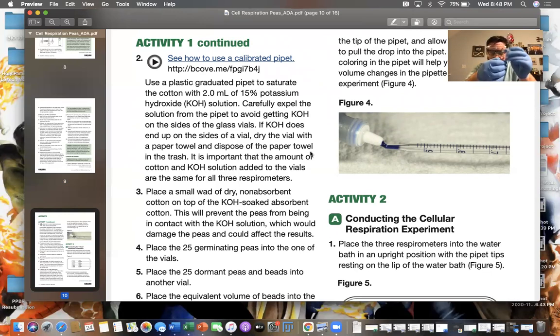If you go up to the top here, so without the water going into the bulb. So you need to do 2 of these onto each one. Okay. We're just going to be very, very, very careful.